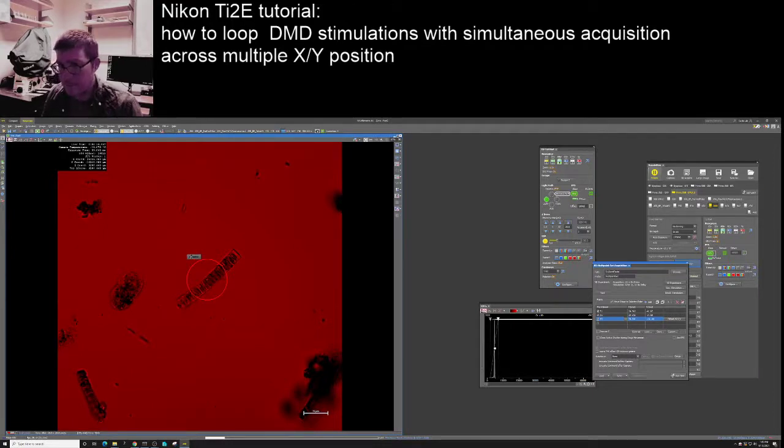Nitesh's experiment is kind of what I was thinking about, where you might want to go to some place, stimulate the release of the calcium through the photocaged chelator, watch what happens to the network, but then move to a different place so that you can kind of automate certain types of experiments you might want to do. So how do we do that?